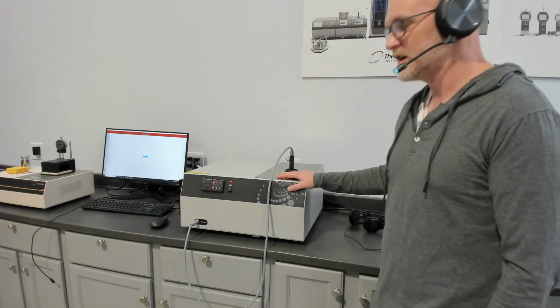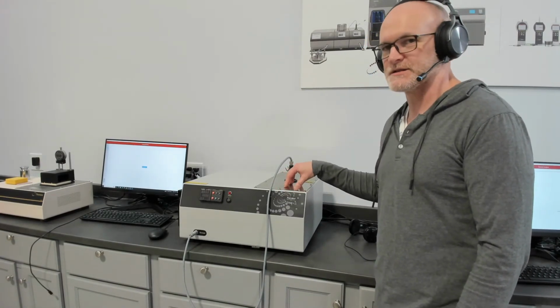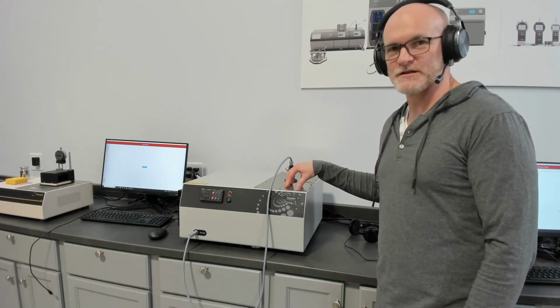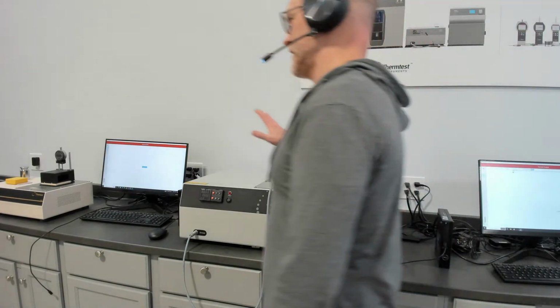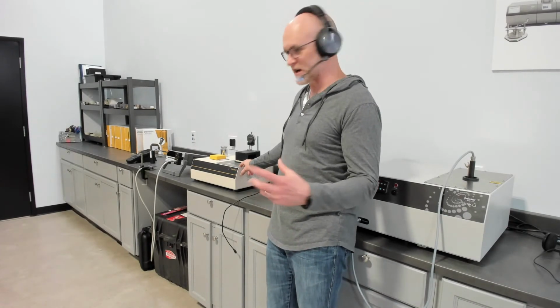This is our focused THW-L1 for measuring thermal conductivity, thermal diffusivity, and specific heat of liquids and phase change materials according to the appropriate standard. And this is our HFM25, which is our baby heat flow meter for measuring insulation, but in a small format.